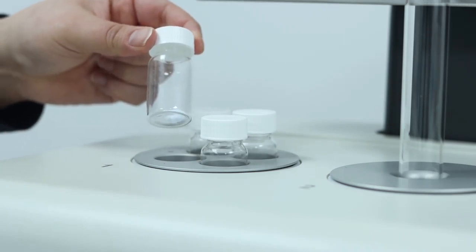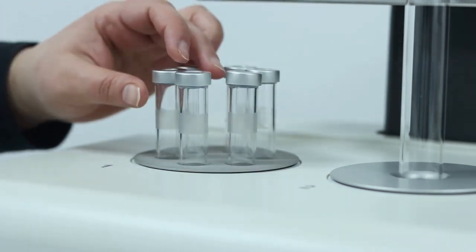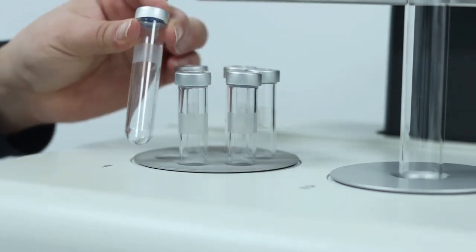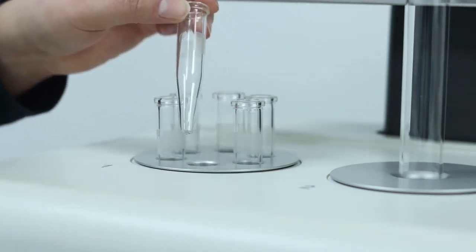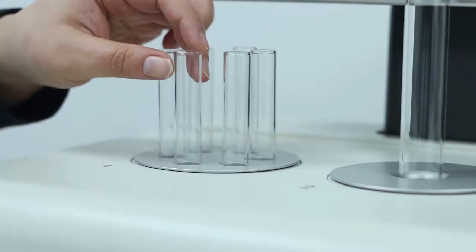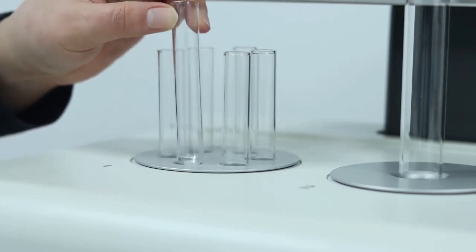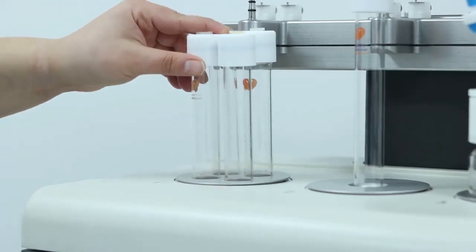Scintillation vials, biotage tubes which are very popular for sealed reactions when working near boiling point, as well as the small volume option, our greenhouse tubes and our carousel 12 tubes.